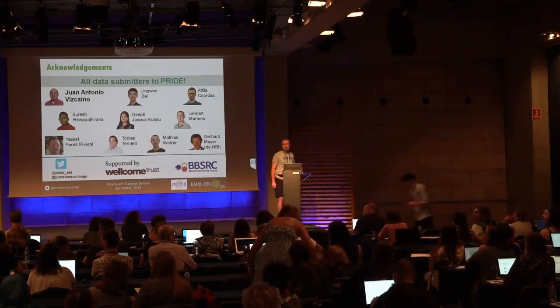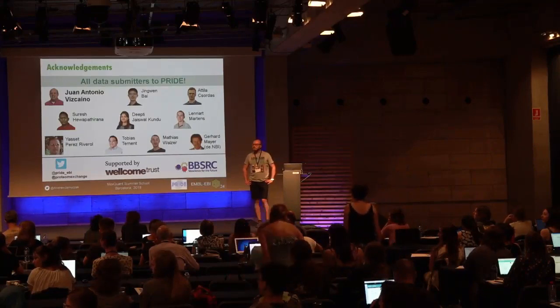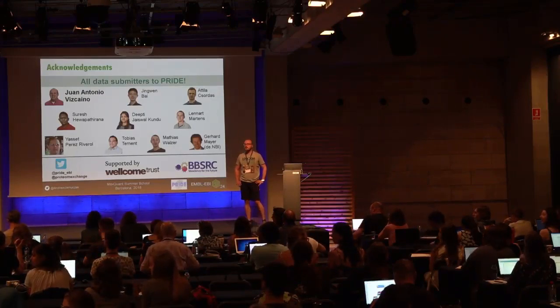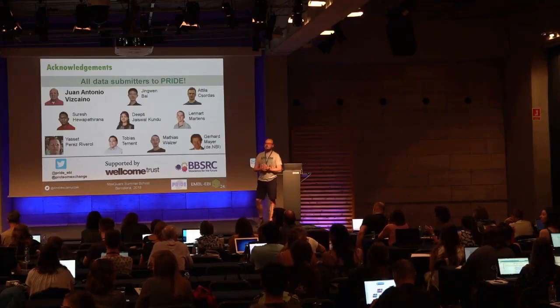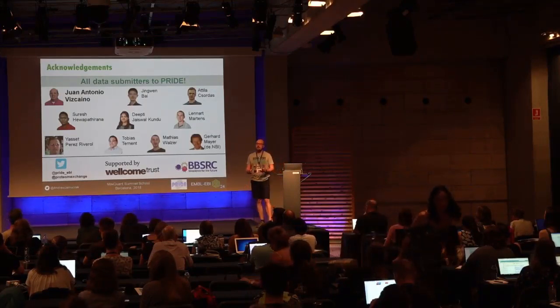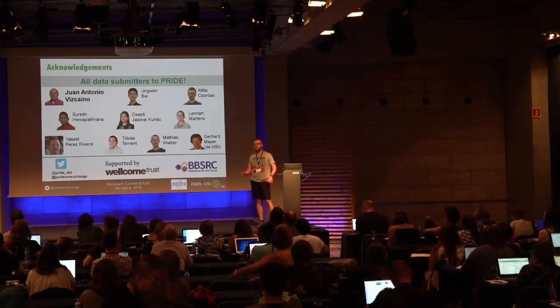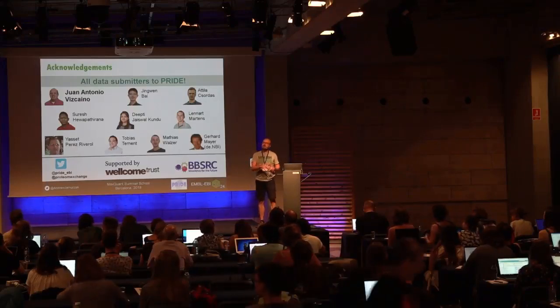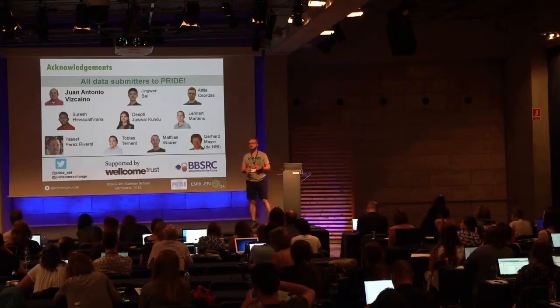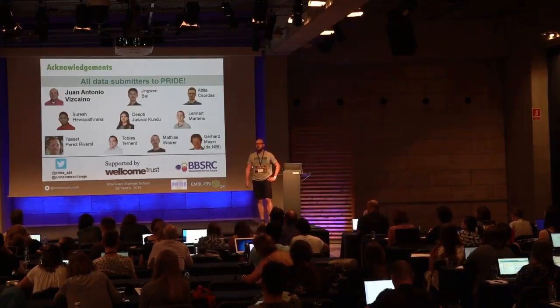Okay, we have a question. Thank you for the talk. Is it possible to upload using a script so that you can streamline this, or does it have to be done with the interface? No, it's possible. We can give you access to our FTP server directly, and then you can script it up and do it programmatically. The only thing is that when I mentioned you can export this submission.px file that contains the information about your submission, whenever you do it programmatically, you also need that file. So you will also have to script that. It's not that complex, but it can be tricky to get the formatting of the file correct. But apart from that, you can do it. Thank you.